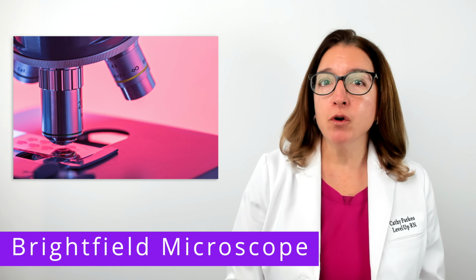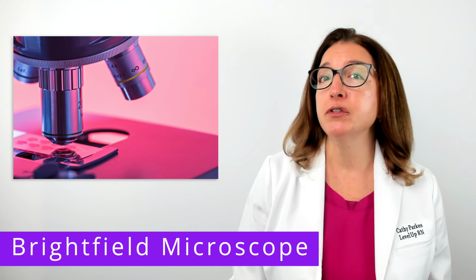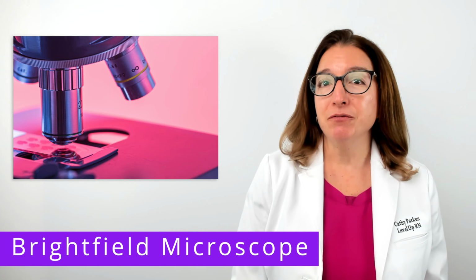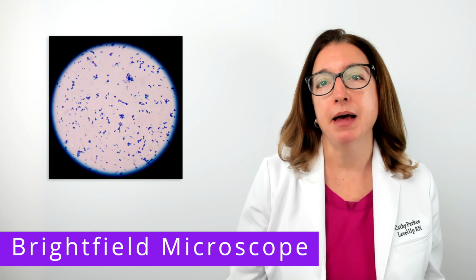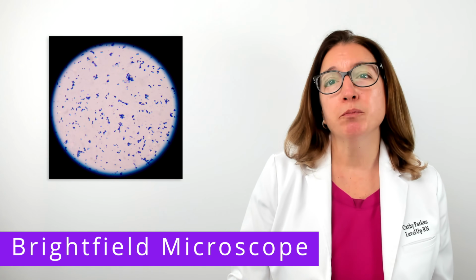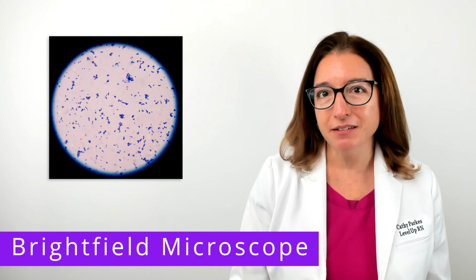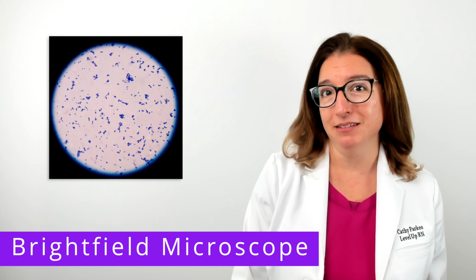Let's now review how a Brightfield microscope works and the key parts of a Brightfield microscope. As I mentioned before, it's the most common type of microscope and the one you'll be using in your lab. A Brightfield microscope uses two or more lenses to produce a dark image on a bright background. Most organisms will need to be stained ahead of time in order to improve contrast and visibility. And of note, the staining process will kill the microorganisms in the specimen.